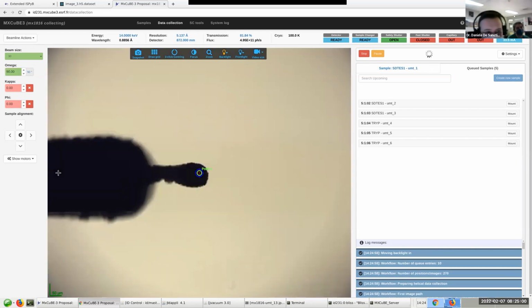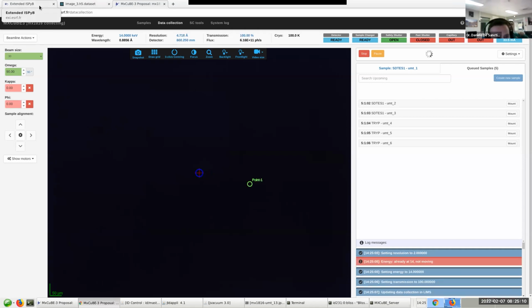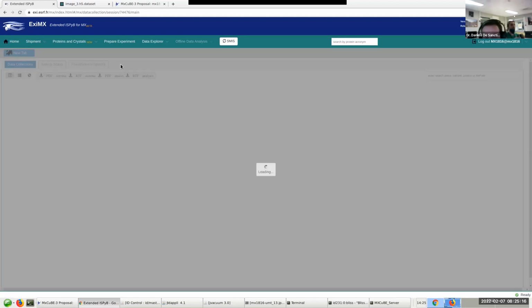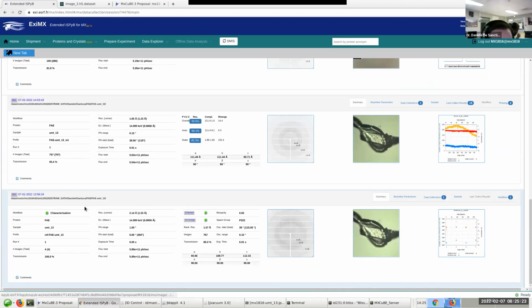Okay, here we are again. So as you've seen, we have done quite a lot of stuff in the last 45 minutes with Daniele, and a very convenient way after a very long day of experiment is just to not care much to take notes, because ISPyB is doing that for you. So we go back to see more or less what you have done over the past hour and a half. So starting from the beginning, we did a characterization.